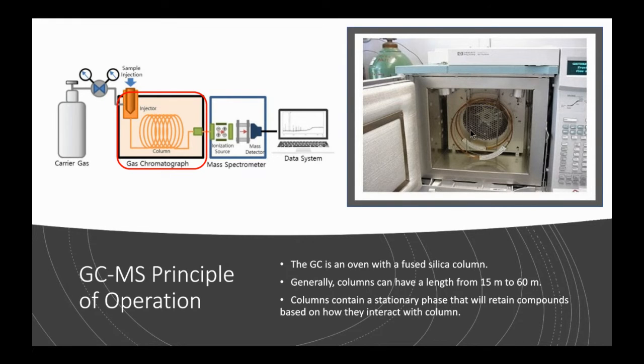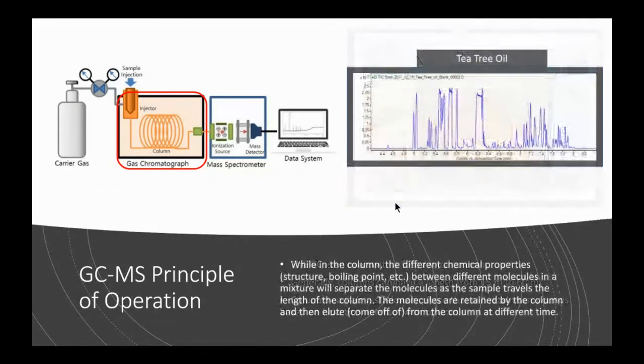Just as a side note, when I worked in industry, the guys in industry talked about how they used to take their cans of soup before they had microwaves, and they would sit them in the GC ovens and heat their cans of soup inside the GC ovens. Of course, we wouldn't do that today. There'd be a safety issue with that, but it is just an oven.